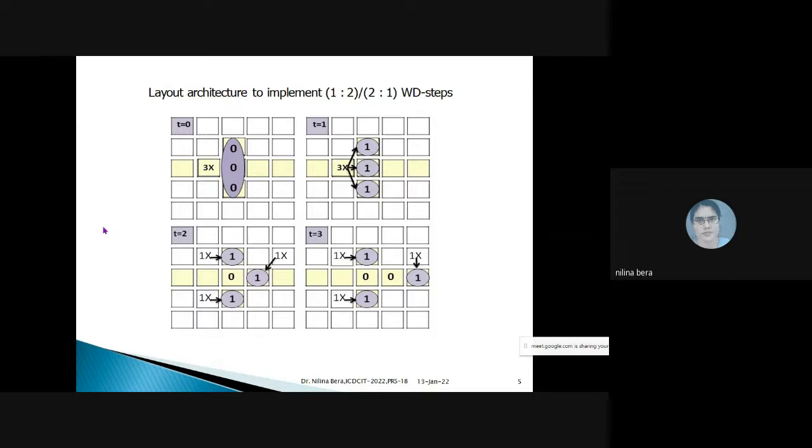After that, we activate the electrodes, that means we are creating three separate droplets, each of 1 unit volume. After that, we move the droplets to the right hand side, that means we are changing the actuation voltage. To move a droplet, we have to activate the neighboring electrode, so obviously it will be a pulling force, pulling the droplet and moving it to the right hand side.